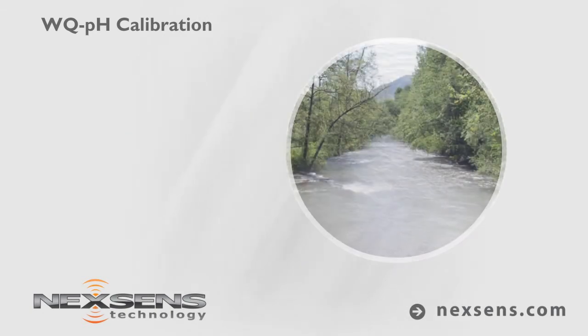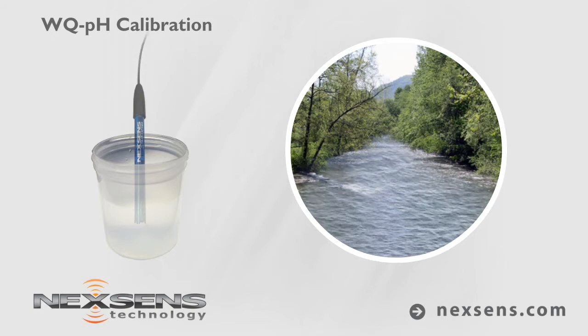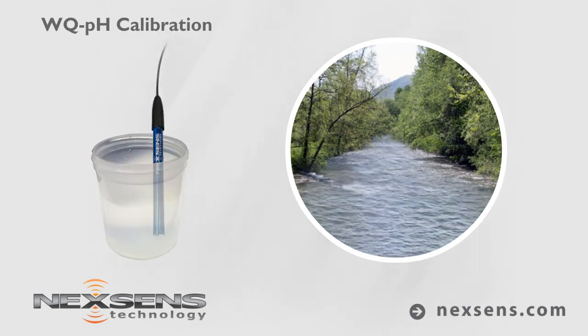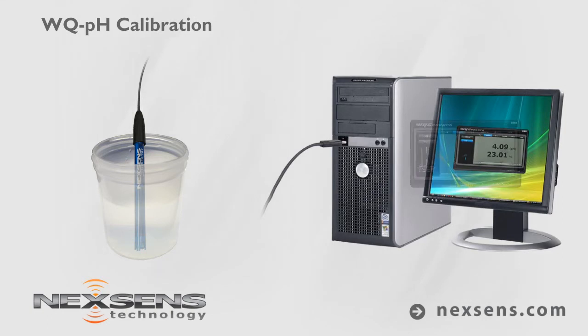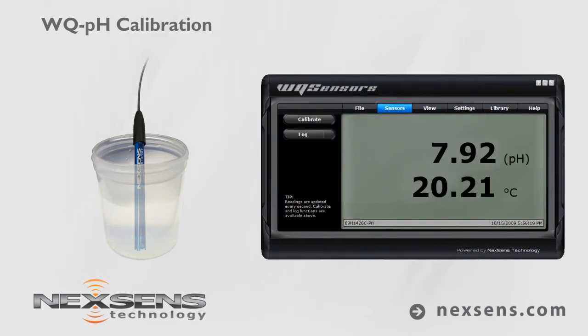Calibration is complete and the probe is ready. Immerse the probe in the river water sample. Gently stir the sample with the probe. When the temperature and pH reading stabilize, the measurement is complete.